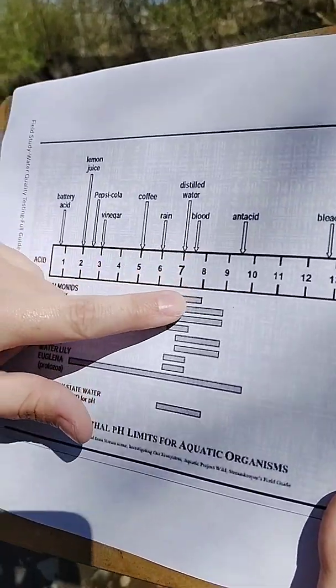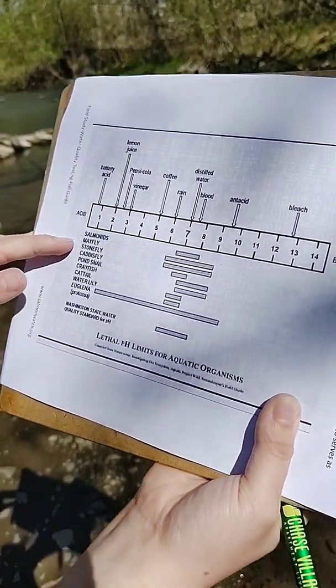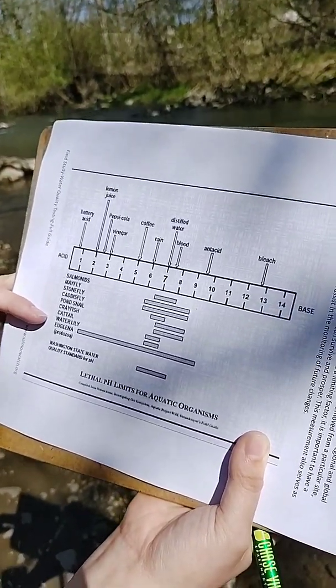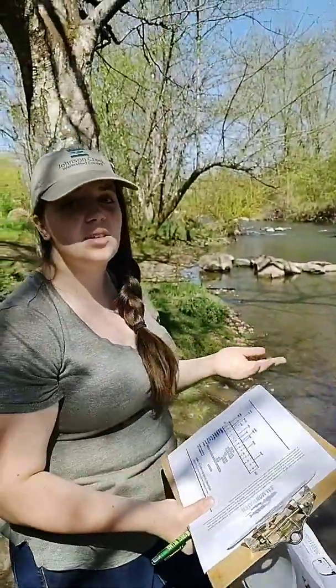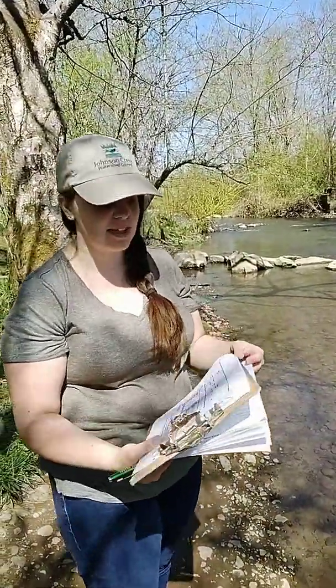But as you can see, it crosses almost all of the bars, right? Salmonoids, mayfly, stonefly, caddisfly, pond snail, crayfish, cattail, water lilies, protozoa. It covers all of them. Like I said, pH doesn't vary that much. If it did, it would be extremely lethal. So our pH score is good. This is what we want it to be at.